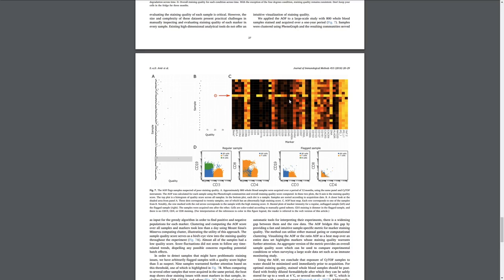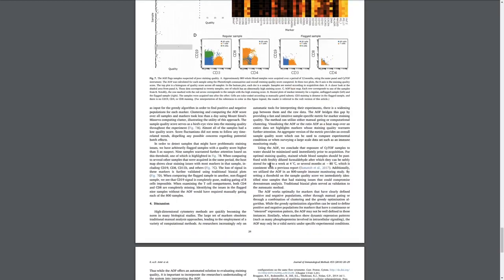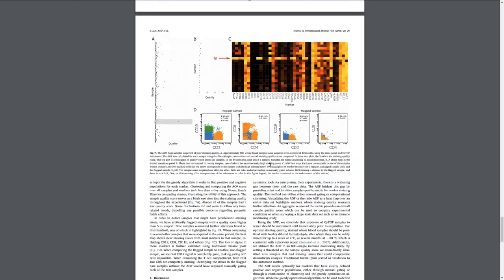And if we focus on them, we see that they indeed miss, for example, CD19 and a few other markers.